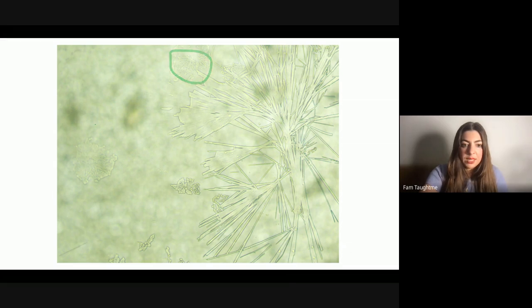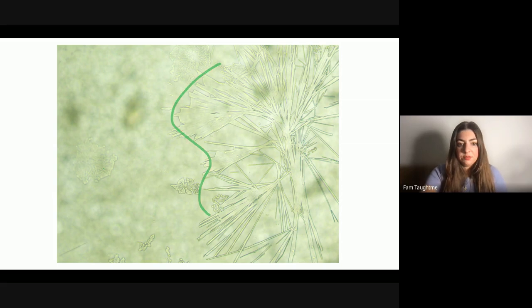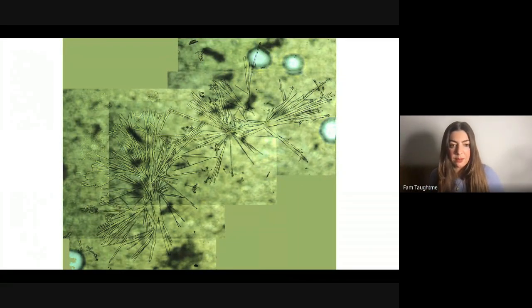And so when I came upon this thing, I was like, what on earth is this? I've never seen anything like this. So I ended up having to take several captures to capture it. It's absolutely massive, whatever it is. I don't know what it is, but it was inside of me. So that was fascinating for me.